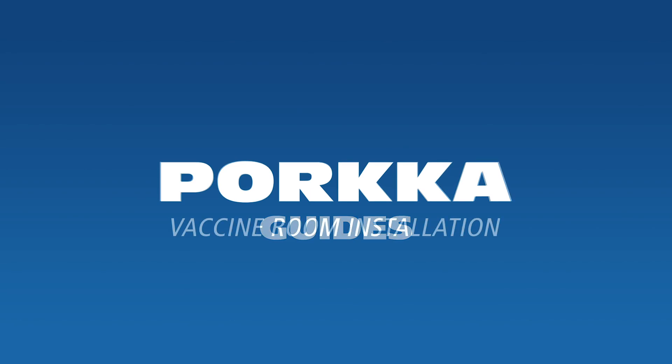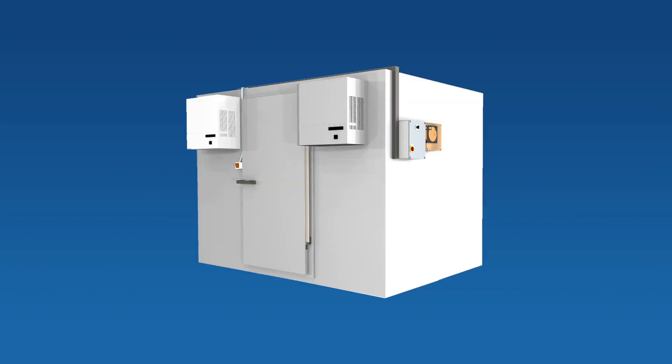Welcome to Porkka Guides. Thank you for purchasing the Porkka walk-in vaccine room. This video is only for visualising the installation process.